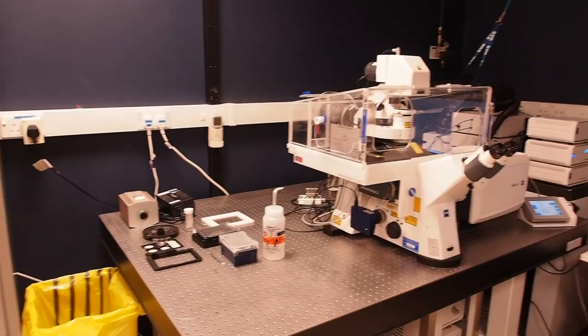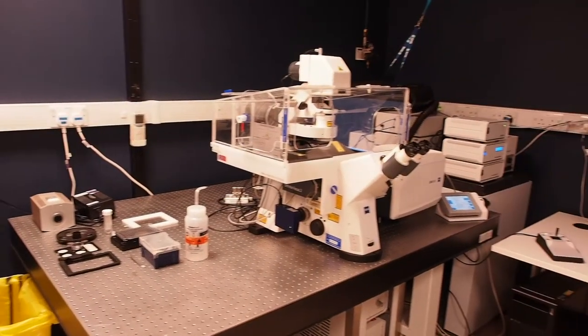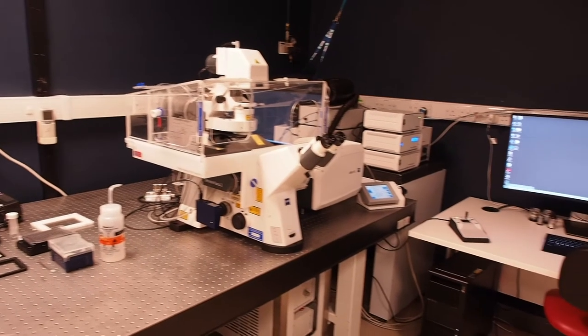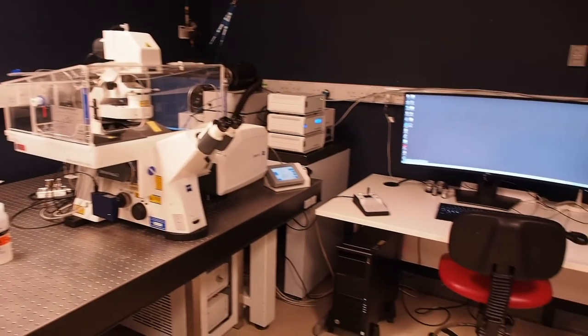This video shows you how to start up the Zeiss LSM 800 confocal microscope and use an air or oil immersion objective.